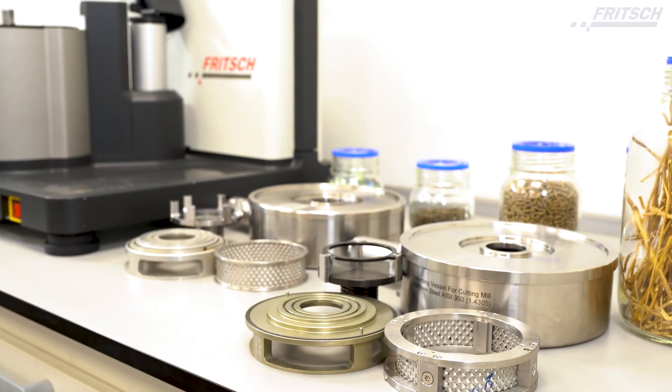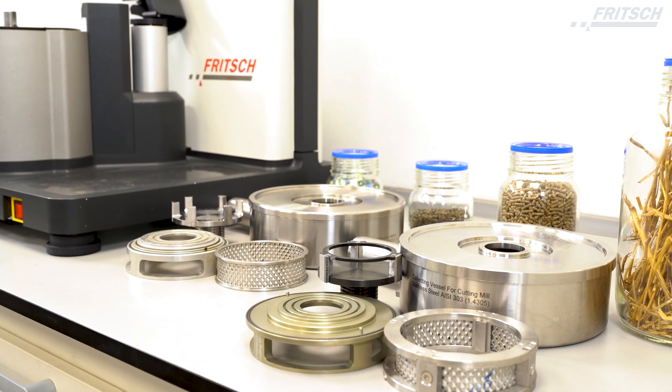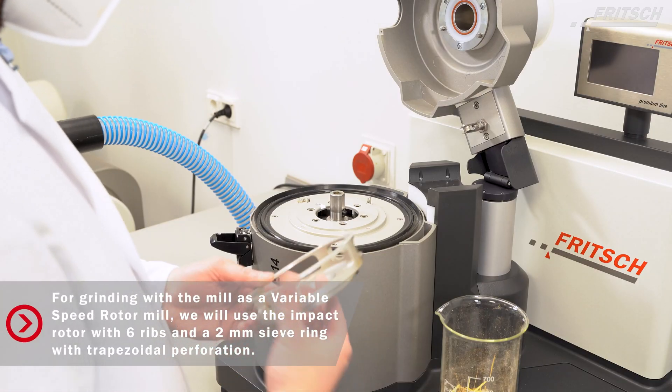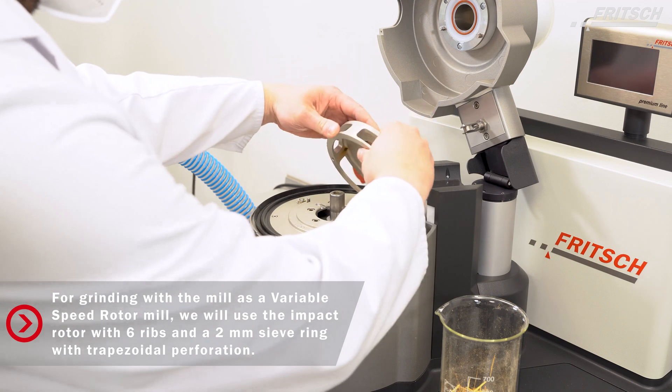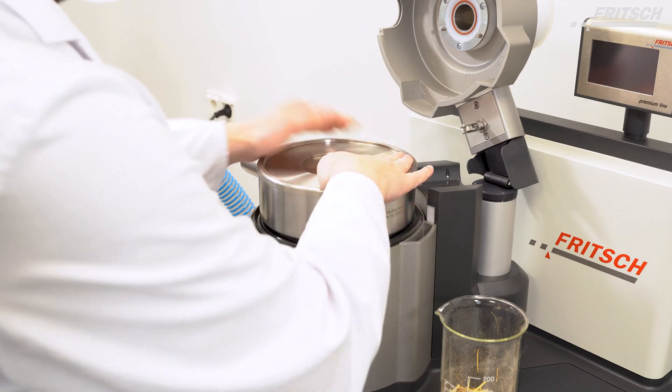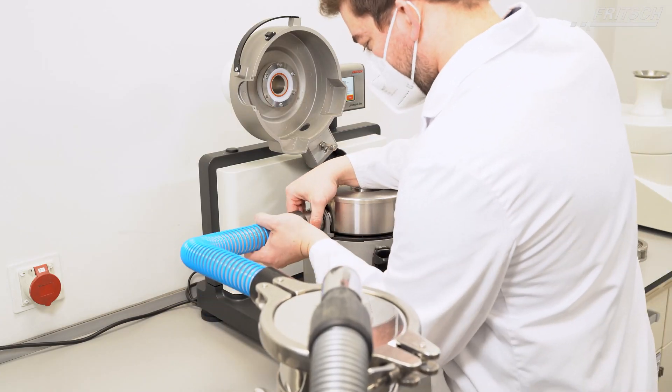The FRITSCH Variable Speed Rotor Mill PULVERISETTE 14 Premium Line offers impact, shearing, and cutting comminution in one instrument. In this application we will show you the differences between the impact rotor and the cutting rotor. We will start with the impact rotor.